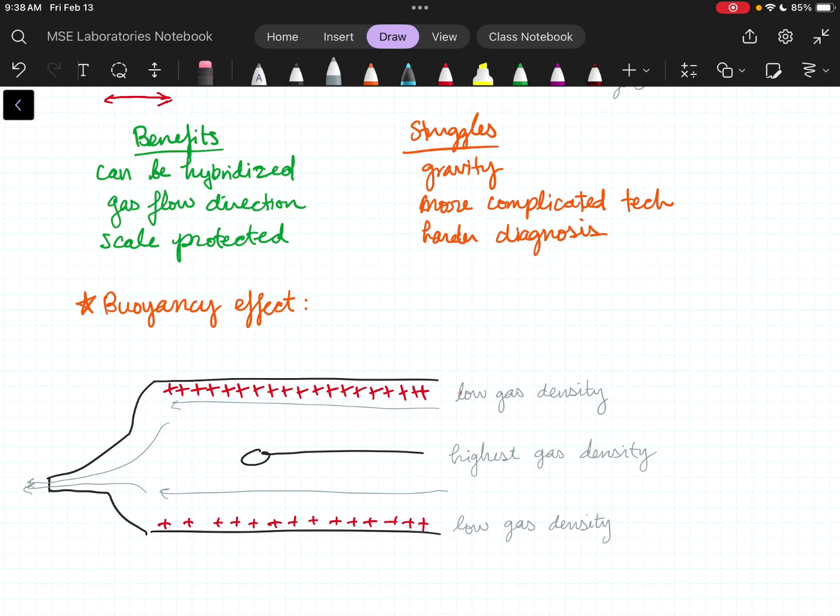This is a tube furnace, so it looks like a little ceramic pipe that's actually providing the heat to my sample. So the walls, the floor, the ceiling are going to be what heats up first. What does gas do when it heats up? It decreases density, and therefore tends to travel upward.